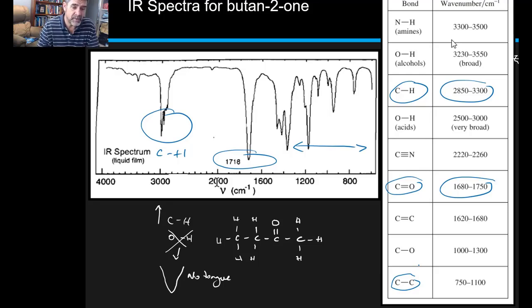Also in this region, we would sometimes find carbon-carbon double bonds. That's sitting in the 1620 to 1680 region, so that's more up here. You can see there's not much going on up here.